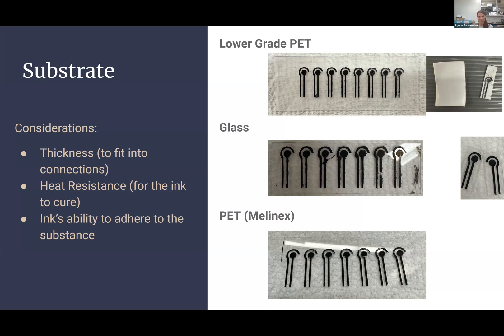The next substrate we considered was glass, which worked well and wouldn't need heat curing. However, I needed to use a glass cutter to fit it into the smaller shapes, which was very time-consuming and resulted in a lot of broken glass and a few shards. The best results came from a higher-grade PET from Melinex. It was very thin and needed to be doubled up with a sticker sheet, but it was the best substrate we found and didn't need any additional prep like sandpaper or chemical adhesion. That's the one we chose to move forward with.